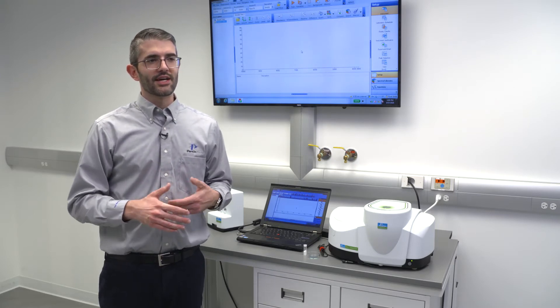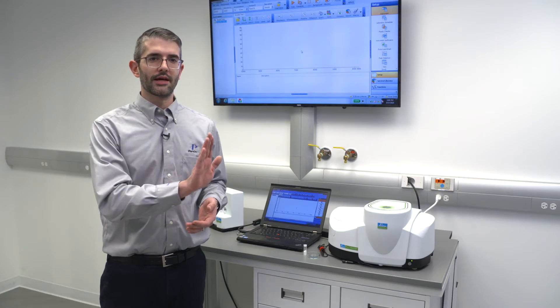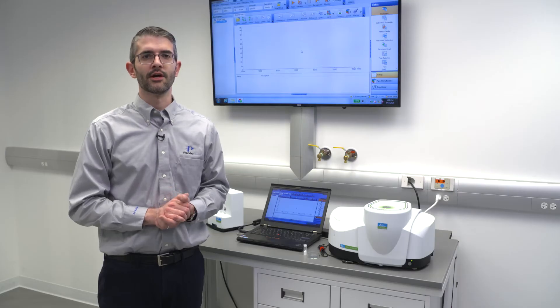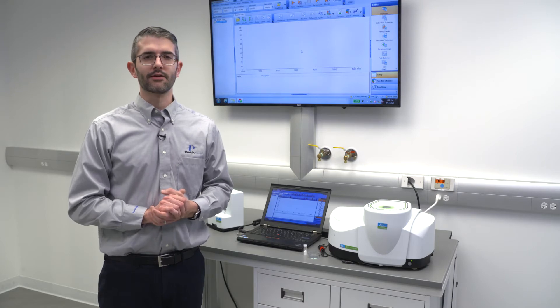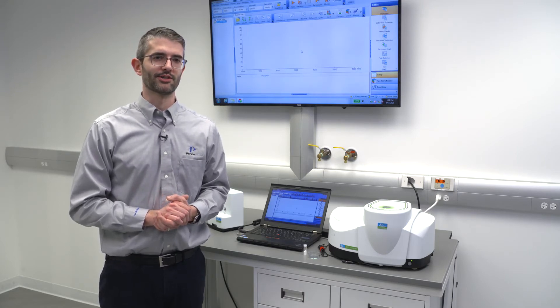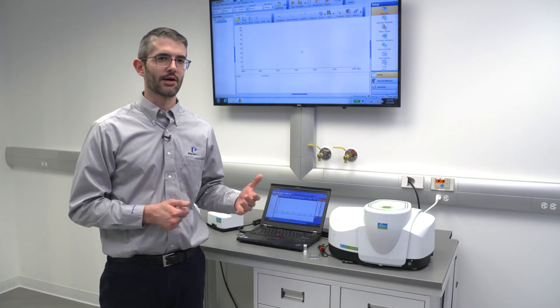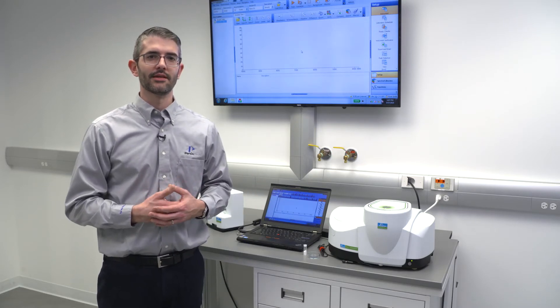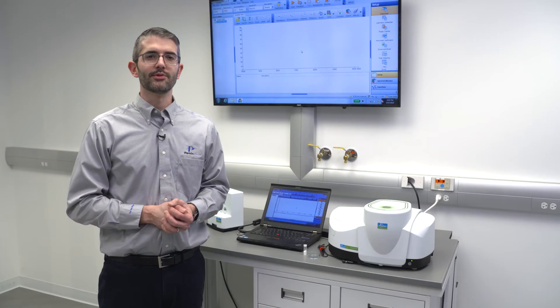This design is unique in that it does not employ a linear translating mirror. The linear translating mirror design is subject to effects referred to as tilt and shear. Tilt and shear, simply put, are effects of misalignment which compromise the quality of spectral measurement. The DynaScan interferometer, because it employs the pivoting mirror pair, is immune to the effects of tilt and shear. These mirrors are fixed to that pivoting assembly, so there's no potential for misalignment.